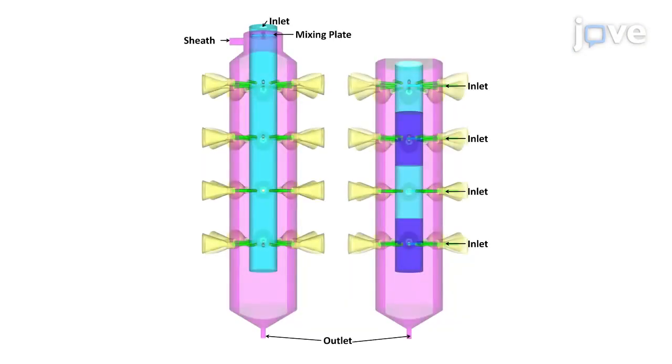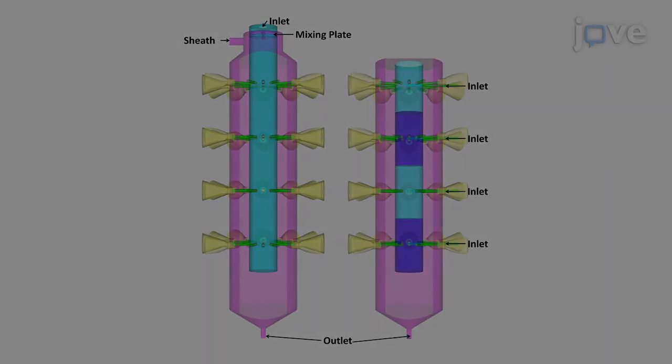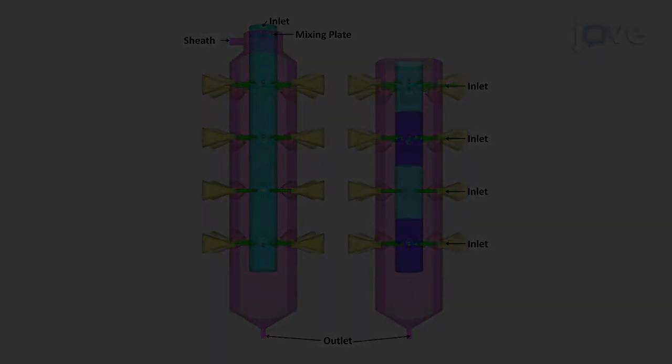To begin setting up a multi-concentration chamber, check it for leaks and set the clean air supply to 23 degrees Celsius.